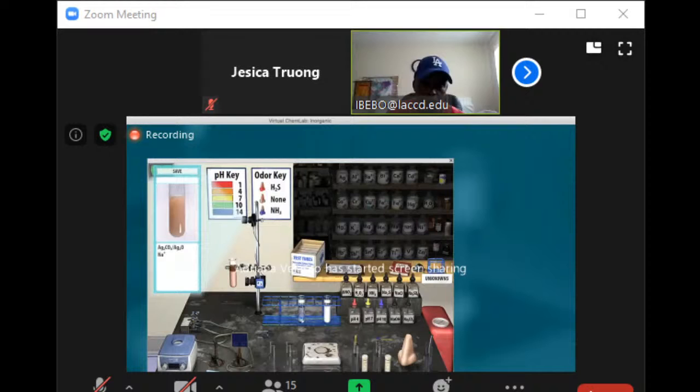So are you supposed to mix multiple items on the actual directions in one test tube? I can show you right now if you like. So I can just start over. So basically the first step is just telling you to pick up the test tube. And then it's asking you to put the silver, so the Ag+. So you put that. And what do you see? A clear solution, right? Yeah, I added the silver. So this test tube is ready, and then you put it to the side.